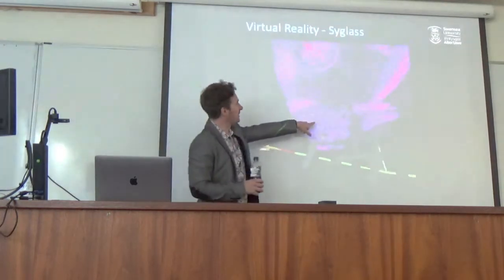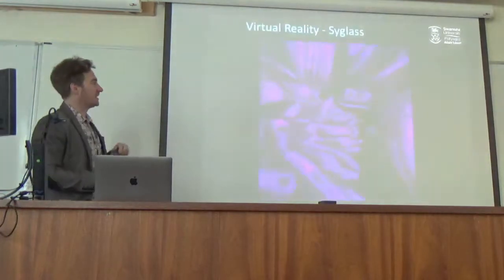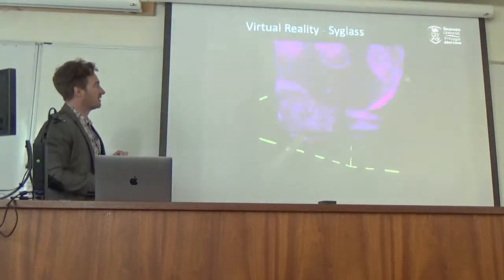So there's the gills, you can see the gills, you can see some muscle fibers. You can actually see where they go, where the muscle fibers lead to. I would just go into the gills. There's the gut.